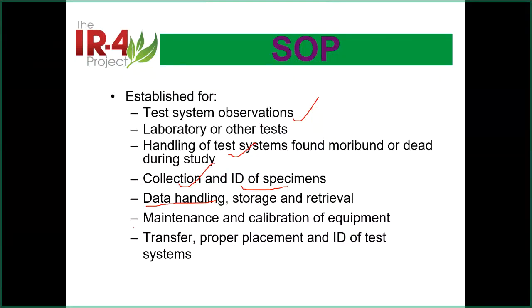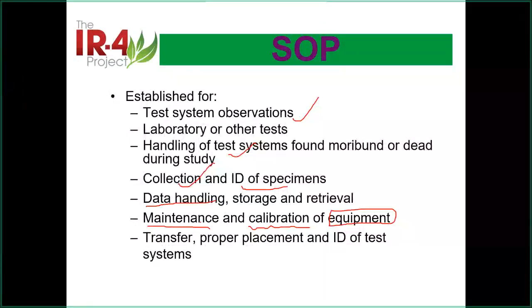And for instrumentation, for example, your equipment here, how you calibrate your equipment, how you maintain your GC, your HPLC, your LC-MS. And when you are talking about maintenance, is it routine or non-routine? This is specified in the SOP. Because if it's routine, that means you routinely check the work, that's okay. If it's non-routine, how will this affect your results? You have to put in your SOP to tell the difference. And you have to tell, is this related to your work so people can find it?